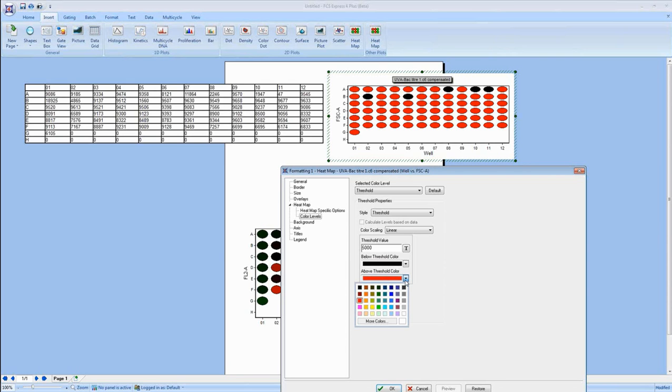And as I mentioned, anything can be formatted in FCS Express. So if we want to maybe make all the others bright green, maybe green for go, and maybe red for stop, we can highlight those any way that we like.